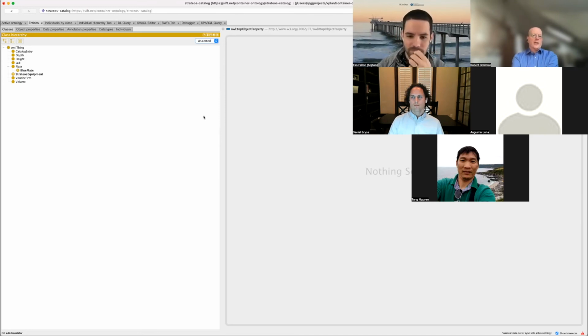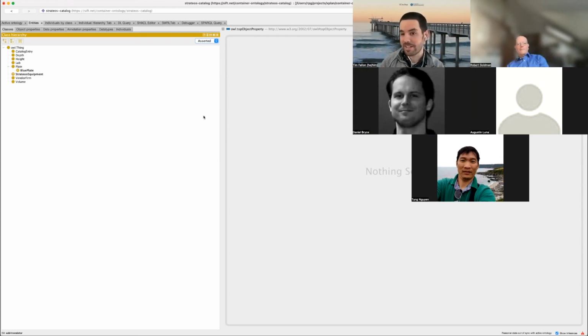Like the Stratios catalog, and partly just also because, as you saw, I just blasted through this spreadsheet and generated that file. I guess it's sort of the way it's structured now. There's separate turtle files for separate catalogs. And I'm sort of wondering how to get away from this concept of necessarily needing a catalog item and sort of putting it in terms of like 1.5 milliliter microcentrifuge tube, 50 milliliter beaker.